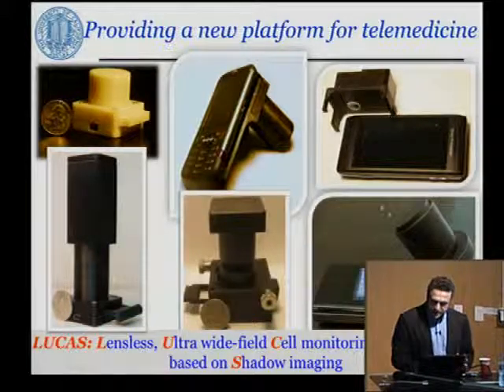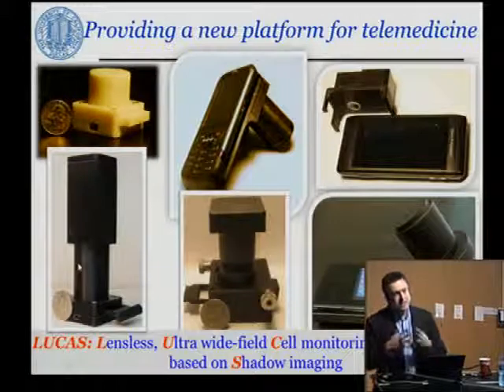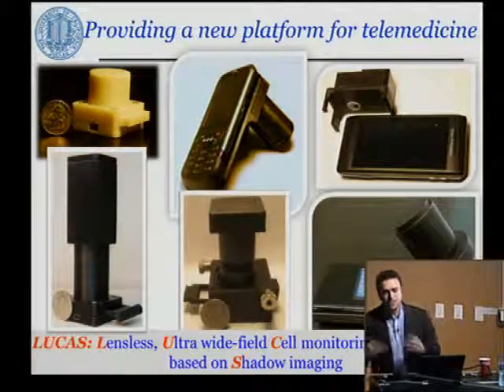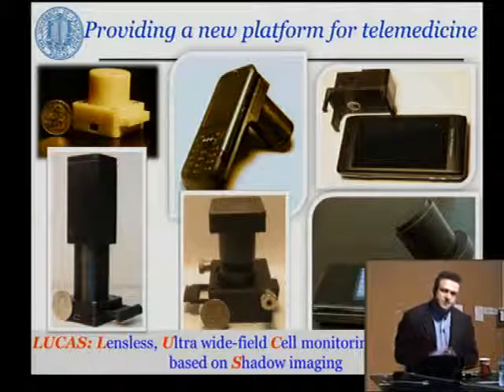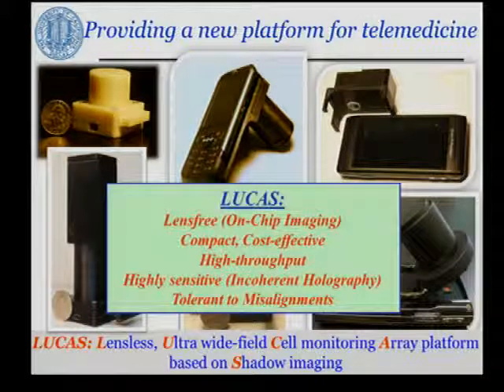In this particular implementation, there are some differences from traditional light microscopes. For example, this interface over here or over the corner, or these standalone devices, they do not contain lenses or an image projection system in the way that we understand point-to-point. They're based on diffraction. They're based on lens-free on-chip imaging. Simply put, they essentially detect shadows of the specimen and reconstruct images in transmission mode from these shadows. As a result, they have certain advantages, also some limitations because of the nature of the design.